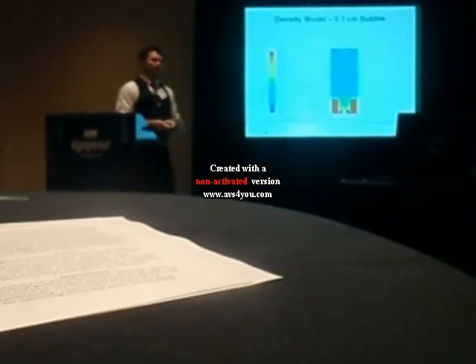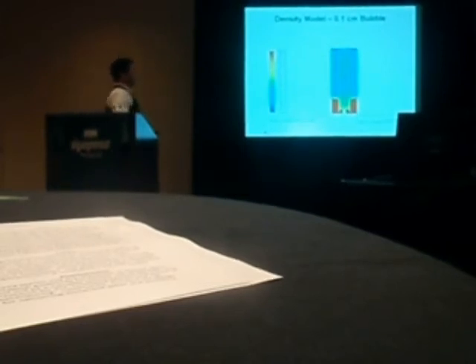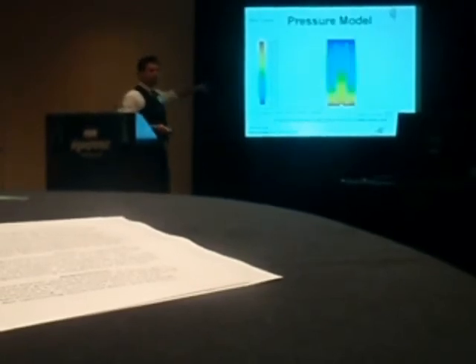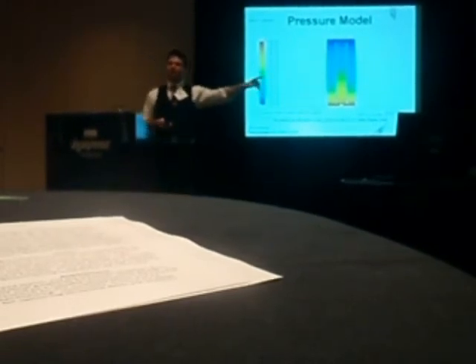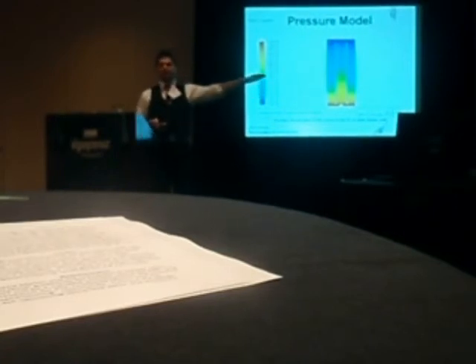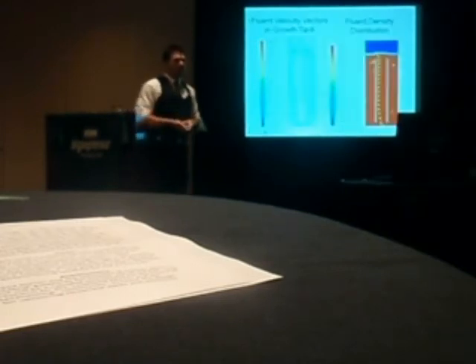We also use Fluent, you can model things like the density of your model, your pressure. This is important for us because we plan on mounting our sensing on the bottom plate, and we have to ensure that you're not going to get leaks through your seals, and that basically your sensor is going to stand up.